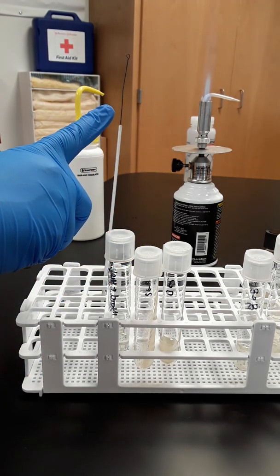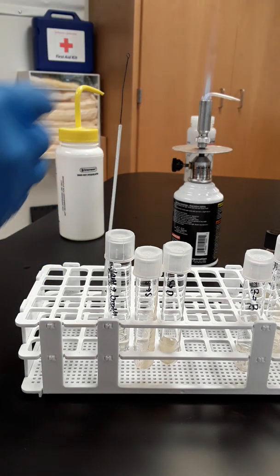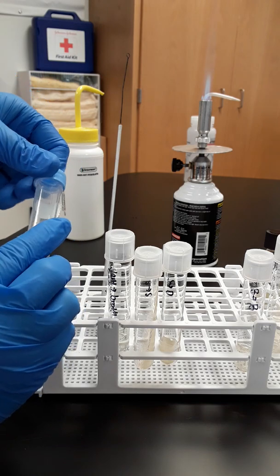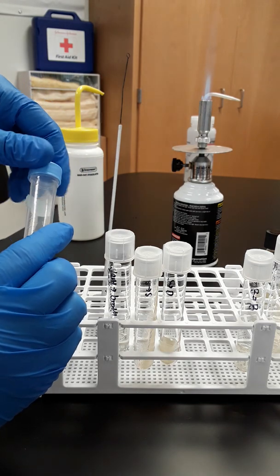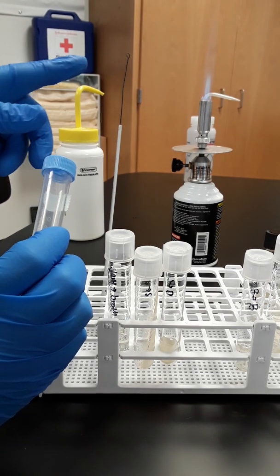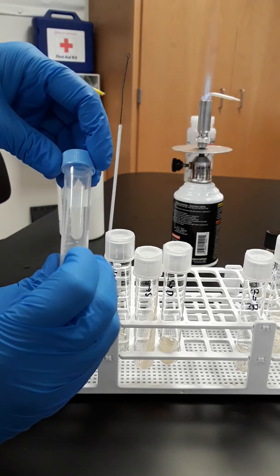If you have to put it down, make sure it does not touch the table. The table is not sterile. If it touches the table, sterilize your loop again. If at any point you feel it's not sterile, contact your instructor and ask what to do. Most cases, if it's the loop, just sterilize it again. If you need a new sample, check with your instructor.